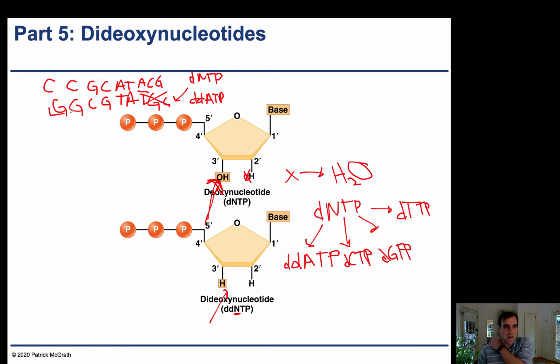And so this creates a set size. If we have a primer over here that we started from, and we know that it extends 6 bases onto this primer, we know where the first T is of the sequence, because that is where an A gets incorporated. And then all of a sudden the termination occurs. So if you ran this out on a gel, what you would have is a specific size band. And you can do this with all possible nucleotides. So in this case, we use ddATP.